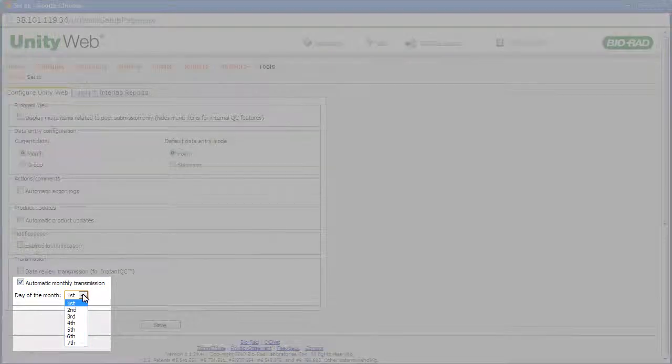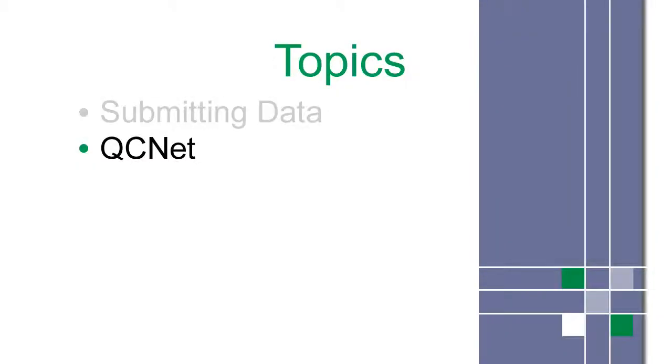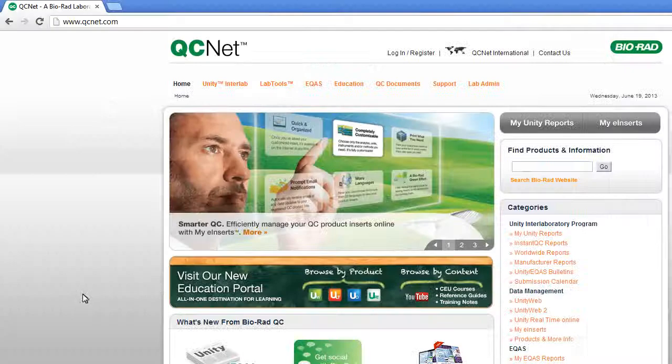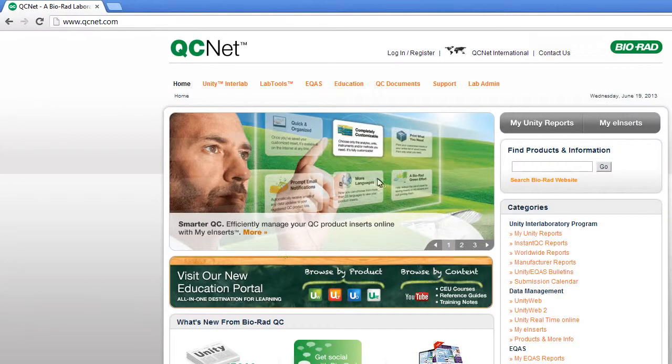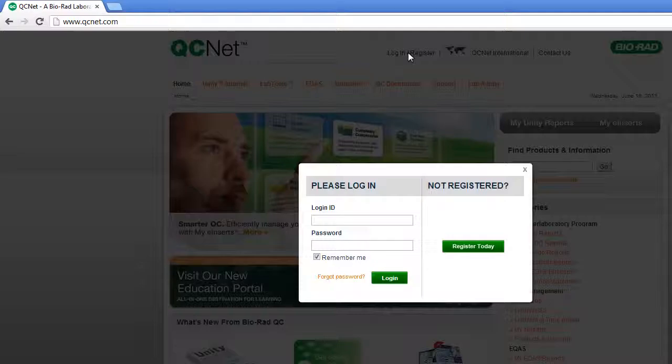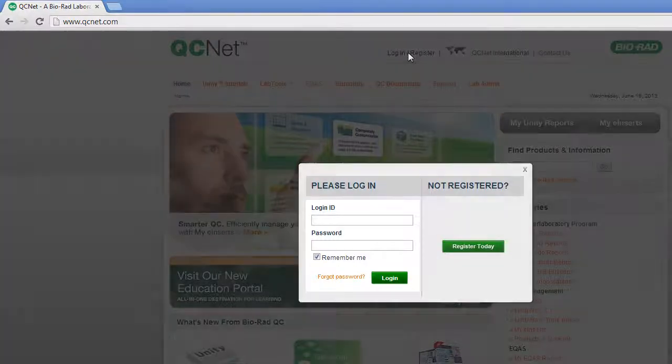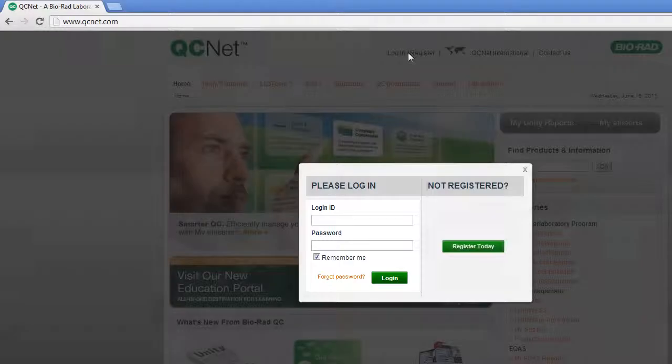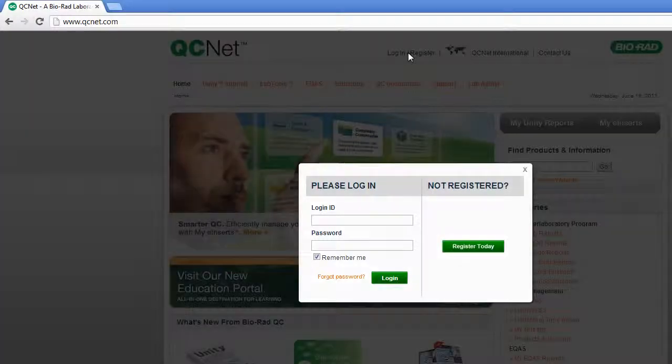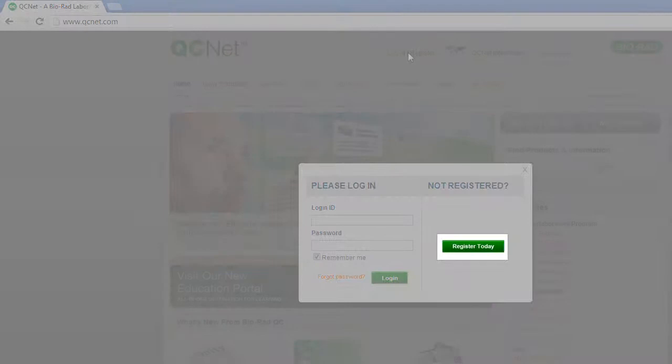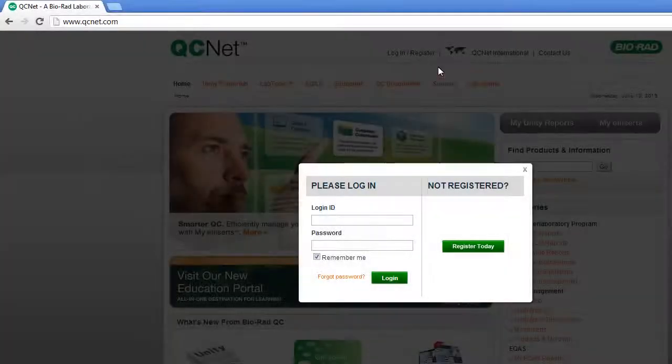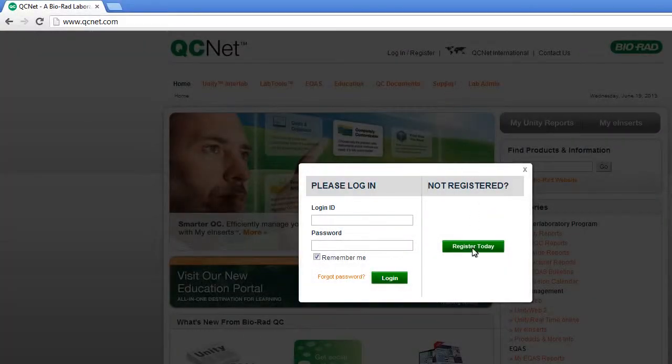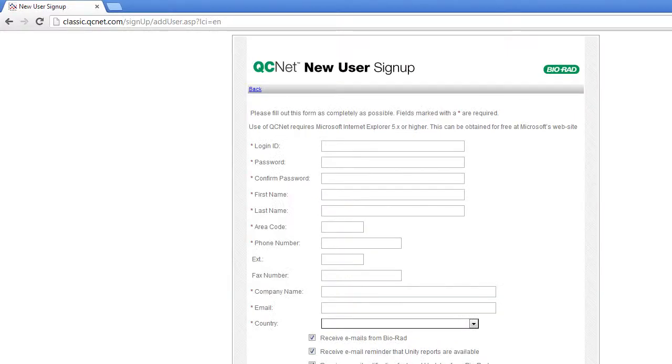In the last step, you submitted your data to the Unity Interlaboratory Program. After this data has been processed, you can access your peer reports on QCNet. First, log on. Existing users enter a login ID and password. New users must register. Completing this registration gives you access to QCNet.